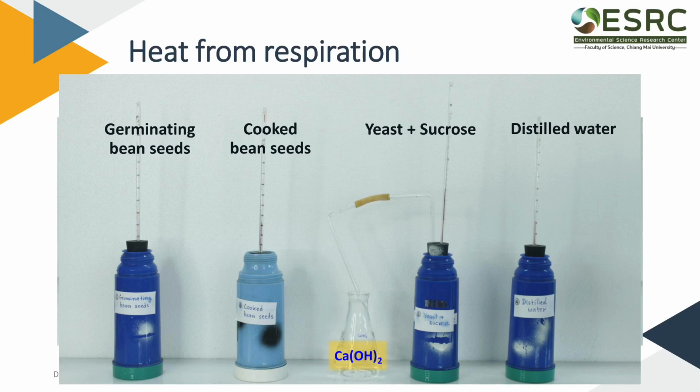The experiment was set up in thermos bottles like this and left at room temperature for 2 hours. Record room temperature and the temperature of each thermos at the beginning and the end of the experiment.